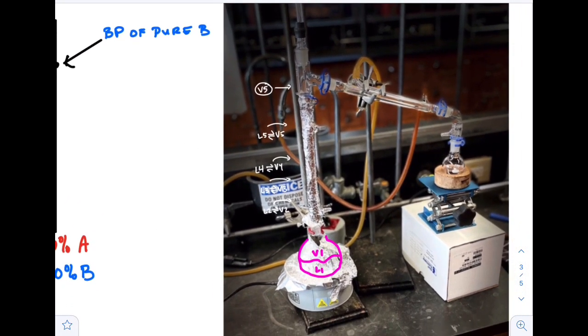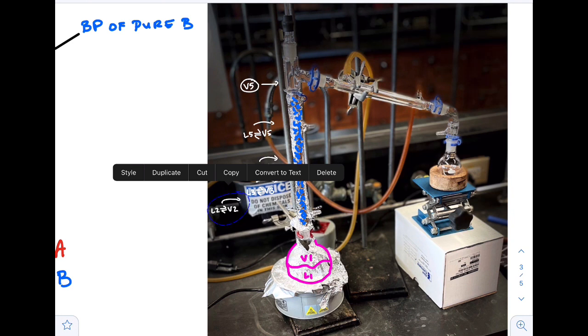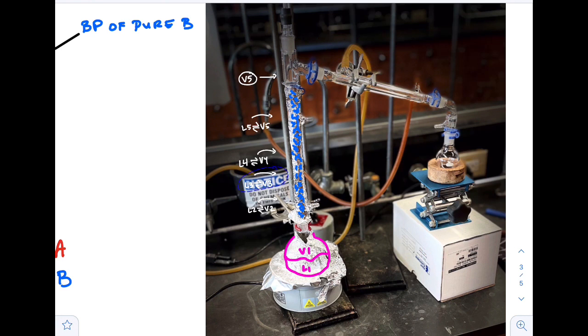So I told you before, this bad boy has some stainless steel sponge in it, right? So it increases the surface area. This liquid vapor heats up, and you can't really see that in white right here. So liquid 2 and vapor 2 are in equilibrium, right? And so let's say they go up, they condense onto this stainless steel sponge material, because it's a solid material, so they're going to touch it and condense into liquid 2, right? And then they're going to go back and forth to vapor 2, and then V2 is going to go up to liquid 3, and then it's going to go back and forth to vapor 3 at this point, right?